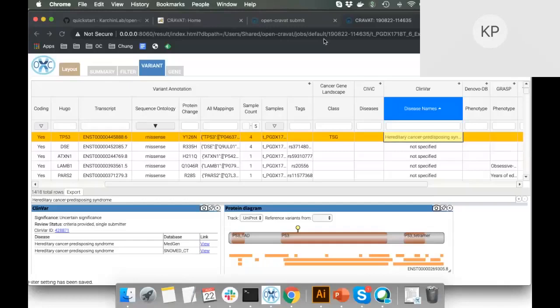Okay, and I have one more question. Sorry, it came across my screen and now I've lost it, but it was about VCF files. One second. I'm not sure why. Oh, is that where it went? Okay, can you start with a VCF that already has annotations in it?